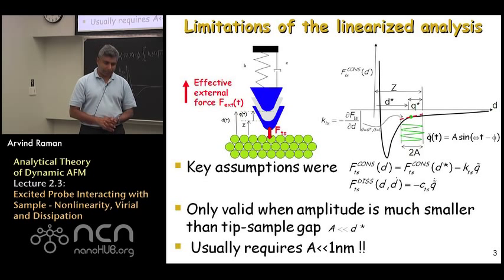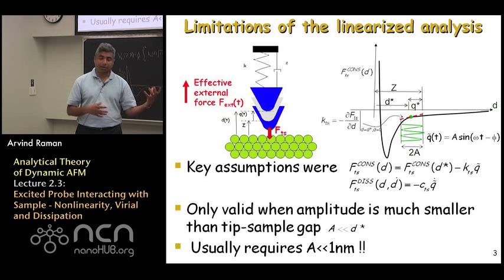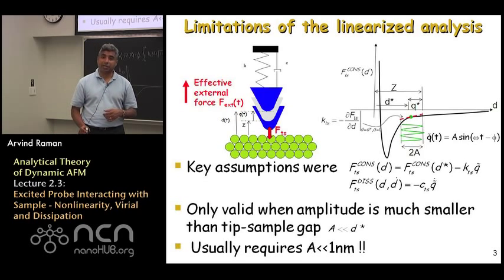So the conditions under which you can describe everything from the scanning to the physics of image formation in these two modes to understanding contrast channels would require oscillation amplitudes to be extremely small, typically less than an angstrom, for you to be able to use this simple linearized theory to explain and interpret one's answers. Naturally, this doesn't usually happen in practice.